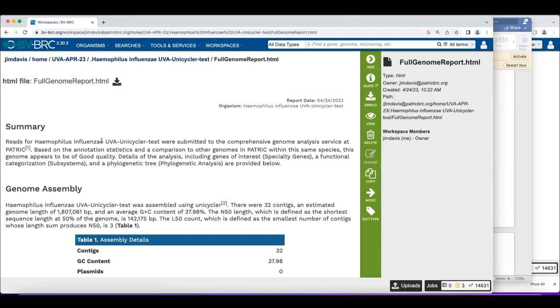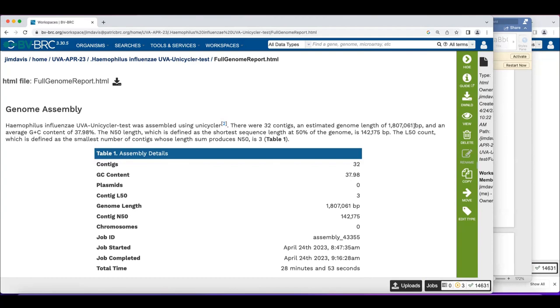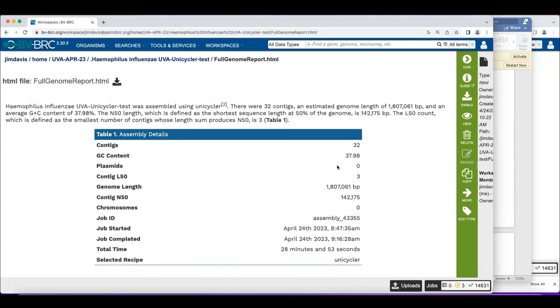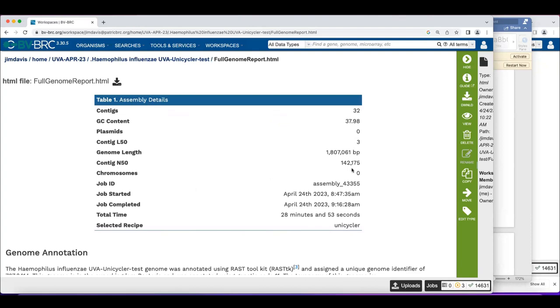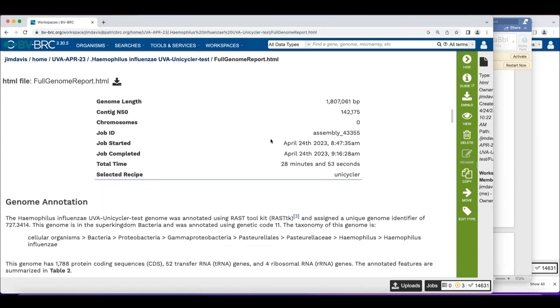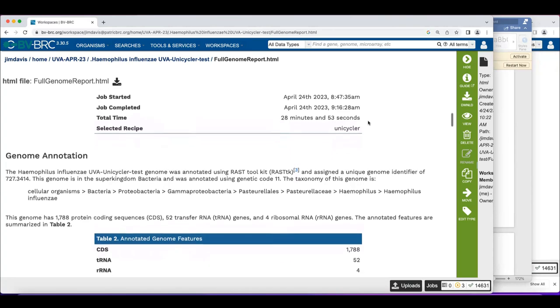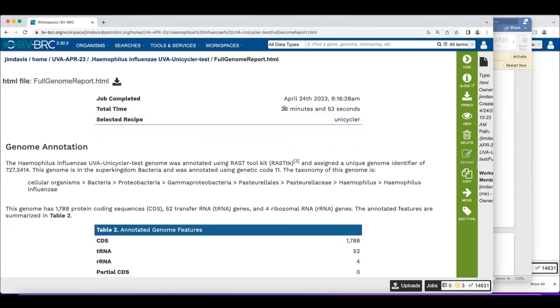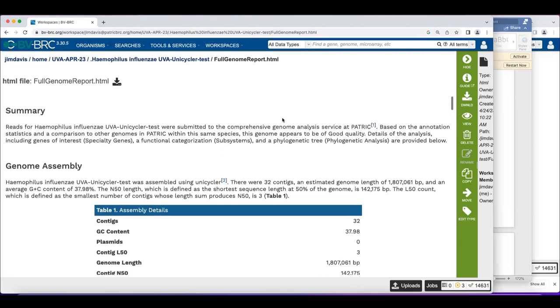The most interesting thing in the top-level directory for comprehensive genome analysis is the genome report. The design ethos is that you should be able to use it as a starting point for writing a genome report. It shows total number of contigs, GC content, various statistics like N50. We got 32 contigs on the Unicycler output. The N50 of 142 kb means half of the assembly is in contigs at least that large — pretty good for a short-read assembly of Haemophilus. This job took 28 minutes and 53 seconds.